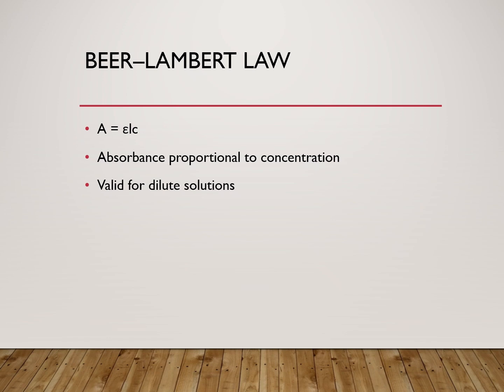Mathematically, it is expressed as A = ε L C, where ε is the molar absorptivity, L is the path length, and C is the concentration. This relationship allows us to calculate an unknown concentration using the calibration curve.